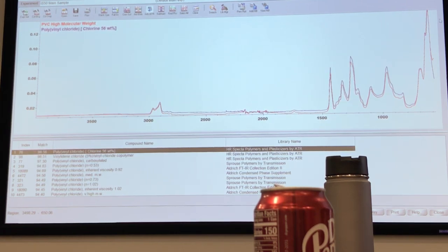One of the simplest examples, and I'll also show it this afternoon, is cellulose and rayon. There is an effort, folks want to separate it out and report this much cellulose and this much rayon. Very tricky, because both have exactly the same chemical structure. It's just how they are polymerized, how they are manufactured, that gives very small differences, usually in just one or two peaks in the 1100 region.